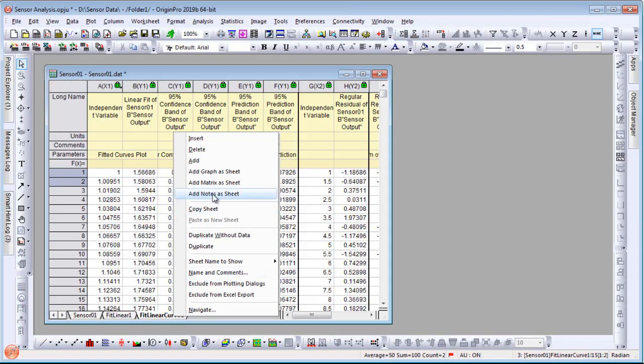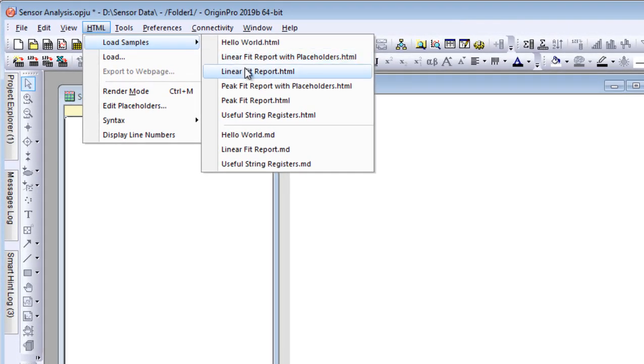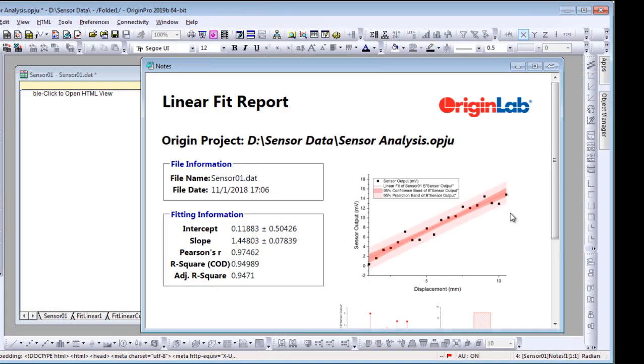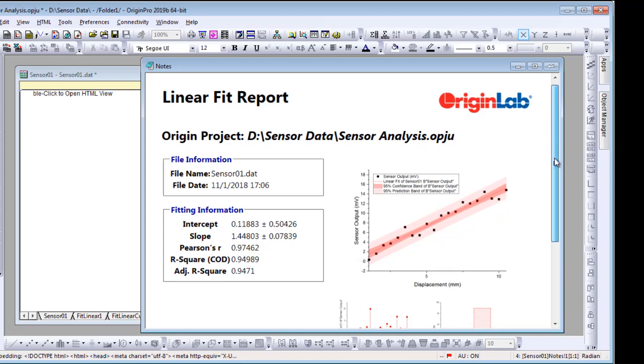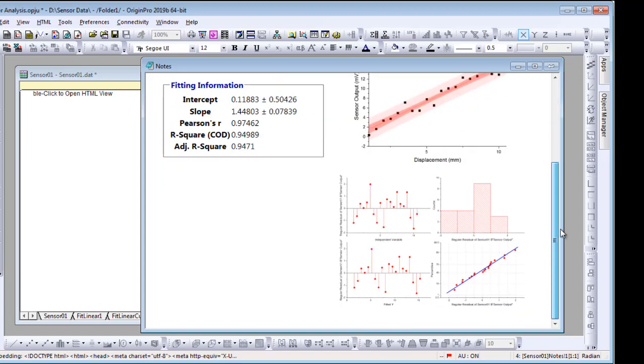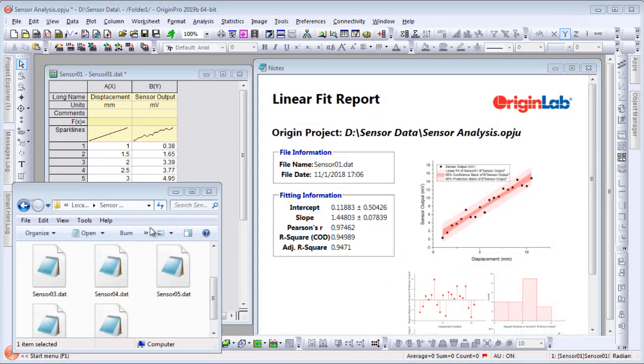Build a custom report using HTML or markdown syntax in a separate notes window. Add desired graphs and tables and a company logo, and you have a report that is ready to share with others.